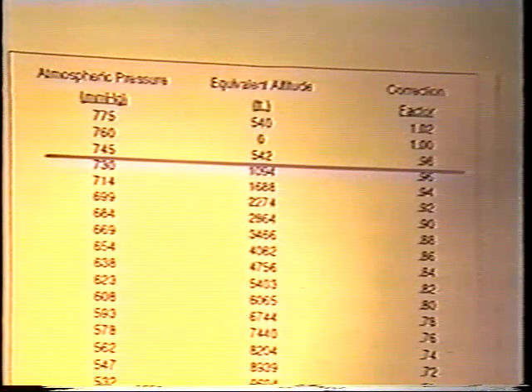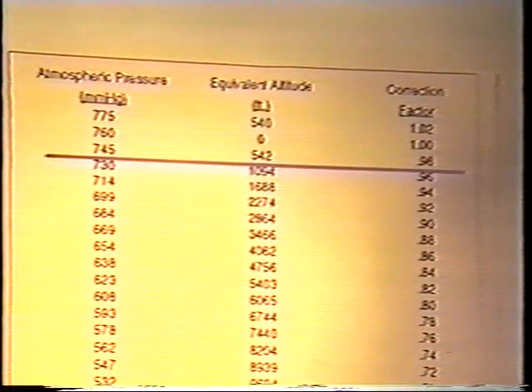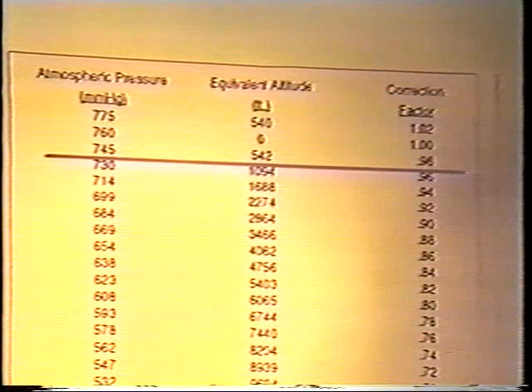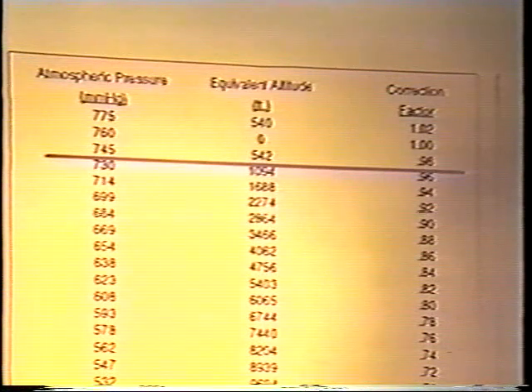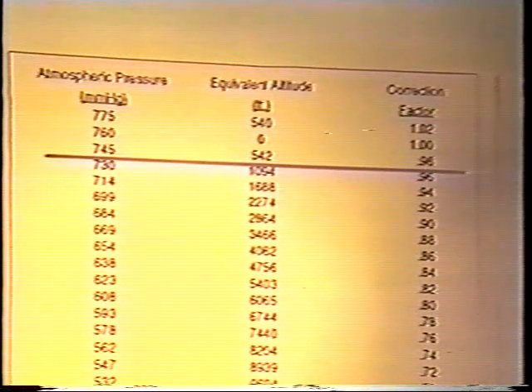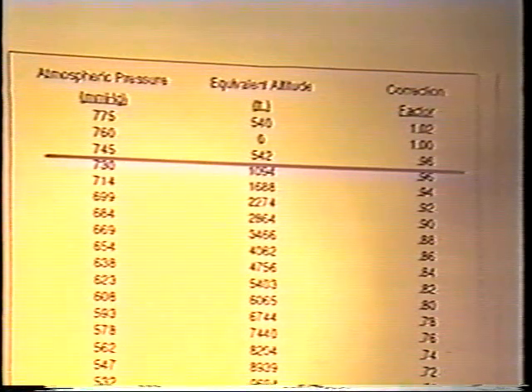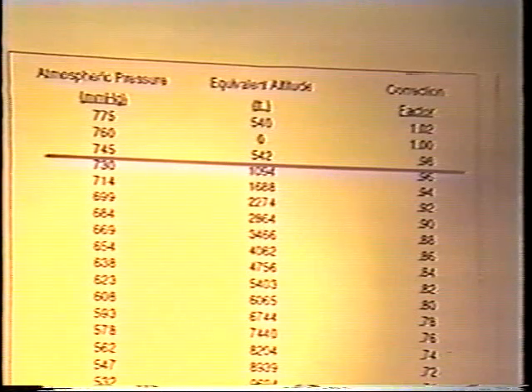We're back. We've collected our data and averaged it three times, so we have a nice, reliable sample. We now have to show you that we need to consider other factors as we do our final calculation of the dissolved oxygen.